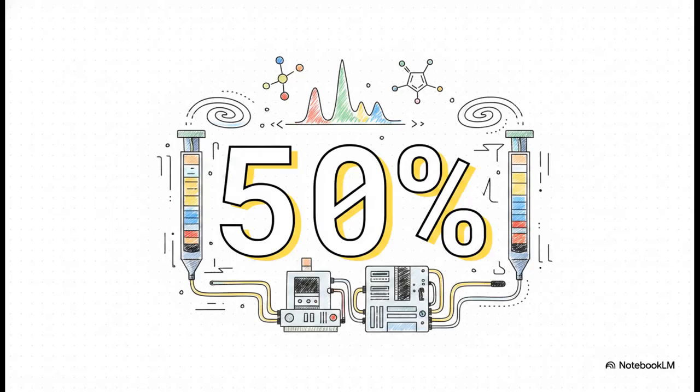Well, to understand just how vital solving that puzzle really is, let's think about this number, 50%. The sales of chromatographic instrumentation represent at least half of all global sales of analytical equipment and materials. Let that sink in for a second. Half! Out of all the analytical techniques out there, chromatography literally has the widest scope of applicability. It's a massive, absolute game changer of a tool that powers labs all across the globe.